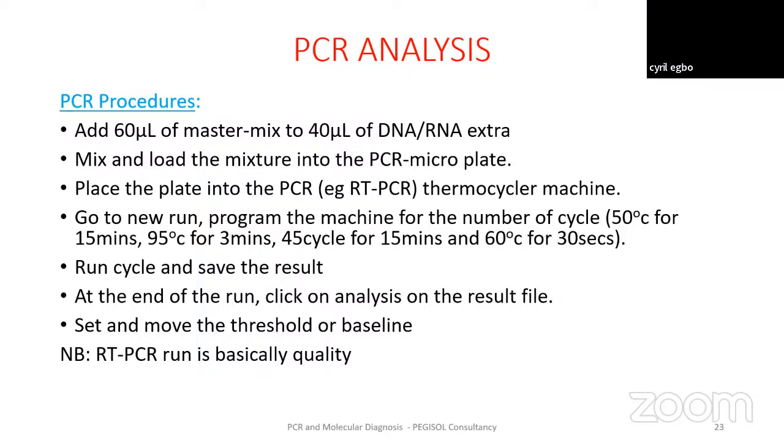So that is the extension process. So there's annealing, there's denaturation, there is extension for RNA extracts. So that is when you are amplifying RNA extract or templates.